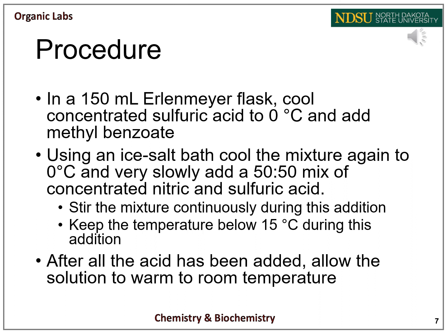You will want to keep this mixture stirring continuously during the addition, and you'll also want to make sure that you keep the temperature below 15 degrees C by adding it very slowly, or else you will get the formation of unwanted byproducts. And then after all the acid has been added, allow the solution to slowly warm to room temperature.